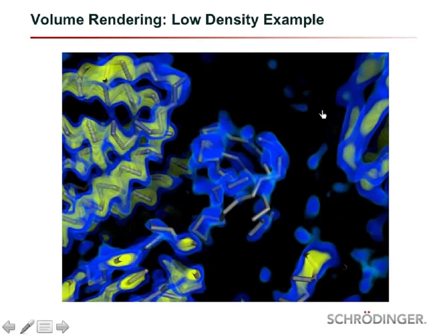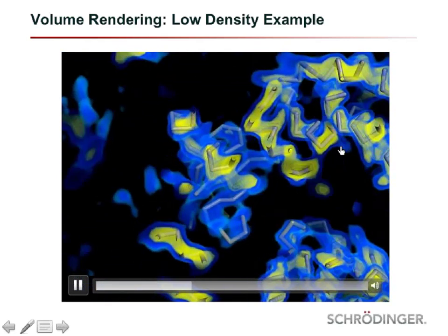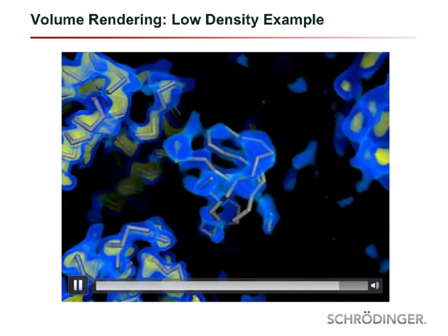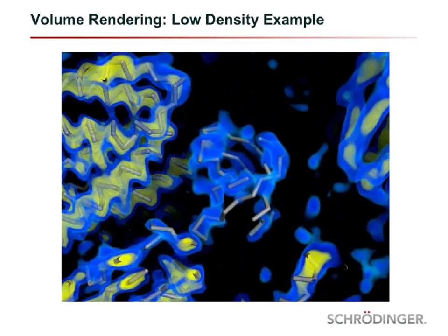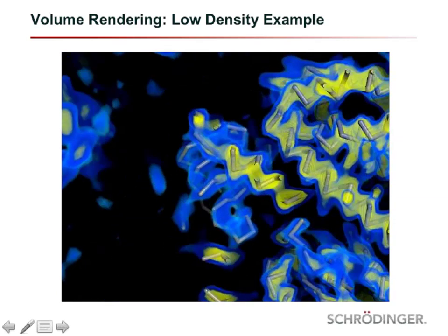And because it's PyMOL, we can also render this into a movie. We would call this a camera motion, so we just change this view and rotate the scene to see from 360 degrees.